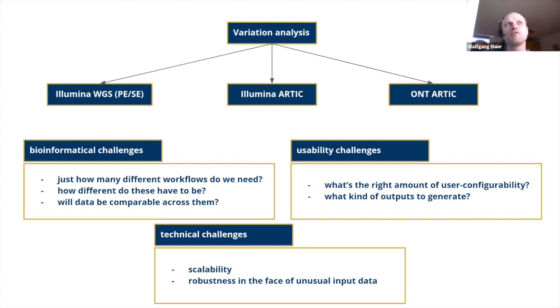You could have very unusual variant lists. So first of all, your variant list might be empty occasionally. So you just don't find any variant for this particular viral isolate, maybe because you have low coverage. You could have multiple alternate alleles. That's of course not an issue if all you try to do is build a consensus genome. But if you're going for these lower frequency variants, then of course you could have multiple of them at the same reference position. So some viral copies might change an A to a G and others might change it to a T. So is then your workflow capable of reporting this correctly, or will it just crash because it has two things at the same site?